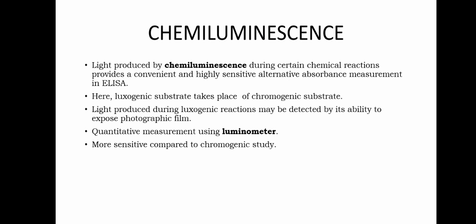Light produced during the luminogenic reaction may be detected by its ability to expose photographic film. The quantitative measurement is done using the luminometer. When compared to the chromogenic study, the chemiluminescence study is more sensitive.